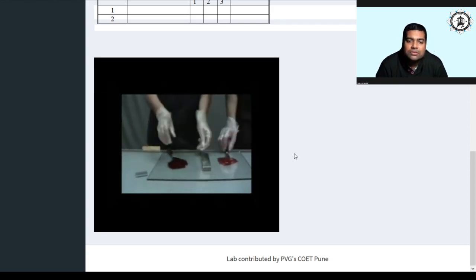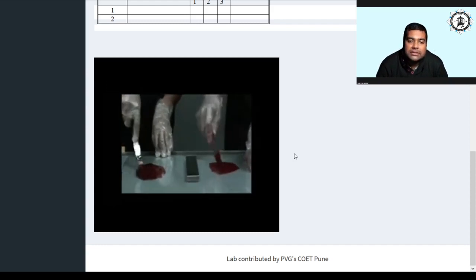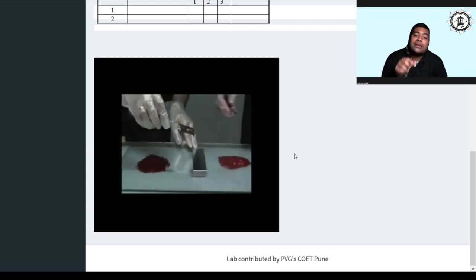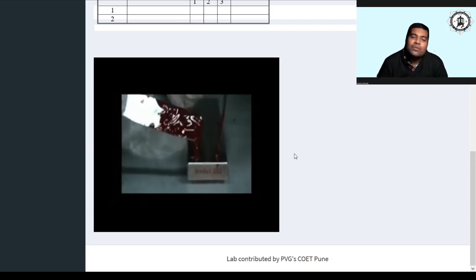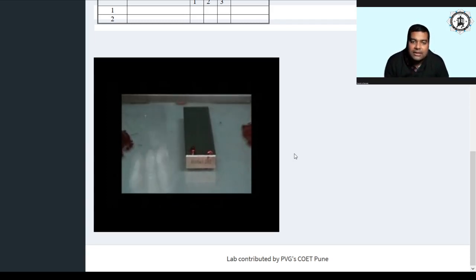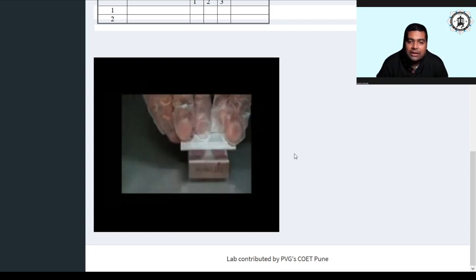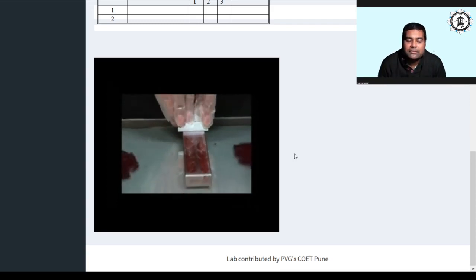Normally 10 micron is a good reading, good dispersion. If there is 10 micron for pasting, normal purpose, it is good dispersion. So two inks will be applied along the two grooves. One ink applied on the left, another ink applied on the right. Maybe one is reference. Actually, in the industry, one is reference, another is the batch which the ink manufacturer has just made to test the dispersion. This is the steel scraper, and this is how they are scrapping. See how they are holding it at 90° and then scrapping the surface.